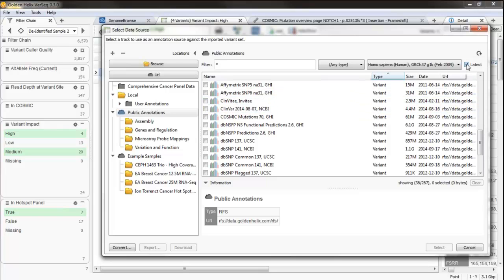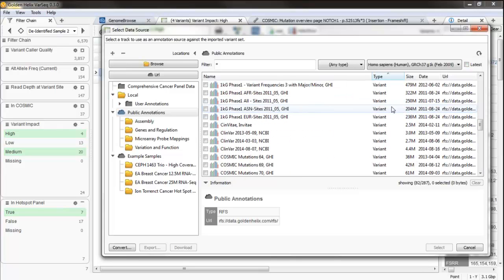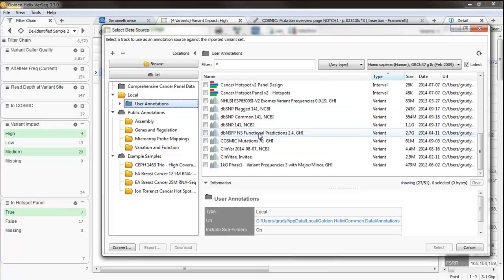And if you uncheck this, you can see that we always publish all versions and keep all versions of our data annotations archived, so you can download any version of this. And of course, once you've had it locally, it doesn't go away. It will be stable for the process. If you're validating against one set of data, you can keep that and choose when to update to a new annotation source. So in this case, I'm going to go ahead and look at my local downloaded annotations.